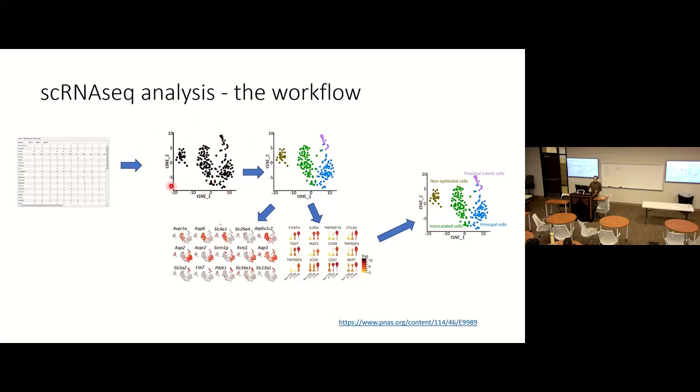After you reduce dimension, for example, you can reduce further from 50 dimensions to 2 or 3. In that case, we can start to visualize the positions of the cells. Once the cells are close to each other, we can group them based on their distribution in this 2D or 3D space. You can also do clustering in the 50 dimension space.